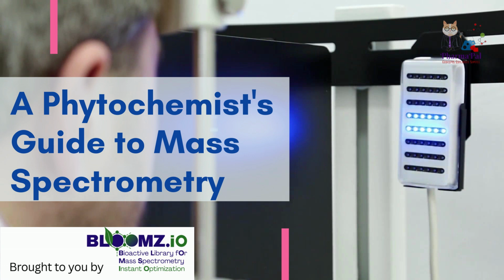Okay, let's do that. So imagine you've got this promising plant extract. Mass spec isn't the very first thing you do, is it? No, generally not. You usually start with extraction, pulling out a whole bunch of different molecules. Right. Then mass spec comes in. It analyzes that complex mix, giving you what you could call a molecular fingerprint. A fingerprint, like a snapshot of everything that's inside. Pretty much. It shows what compounds are present and, importantly, their molecular weights. So it's like getting a guest list for a molecular party with everyone's weight listed. That's a good way to put it. And knowing the weight is often that first crucial step. It helps you start filtering, maybe ruling out known compounds, narrowing down the possibilities.